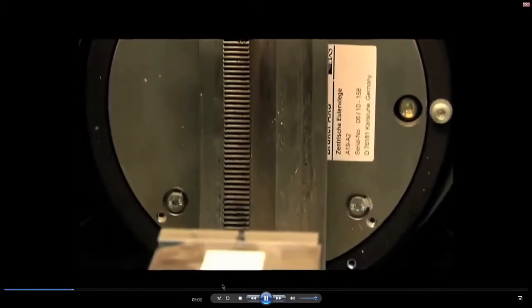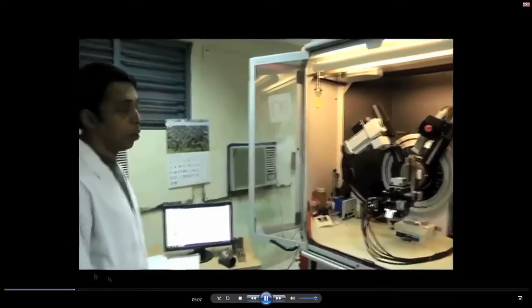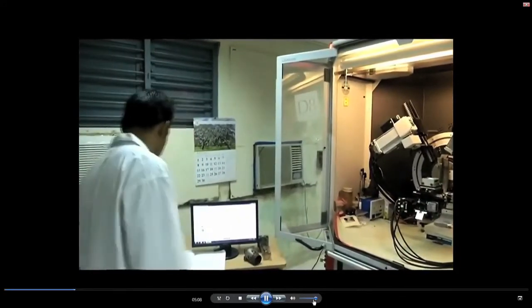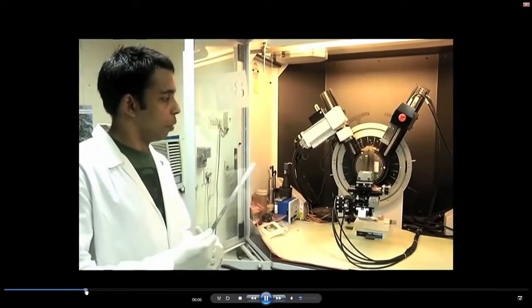The specimen also can go in a semicircle fashion in this manner. So, what I would like to do is, before our scholar performs the experiments, let me also explain some of the basic components.